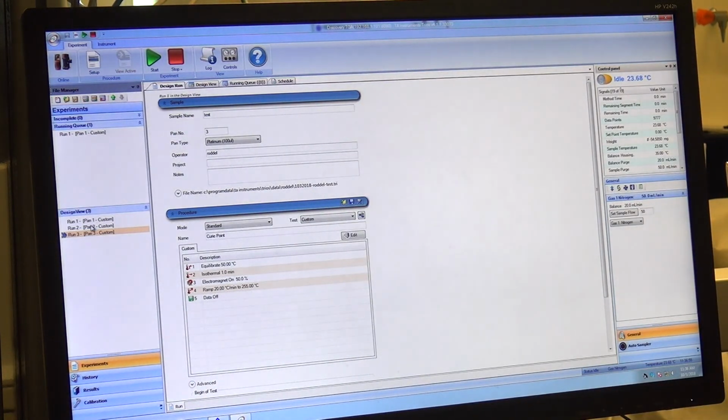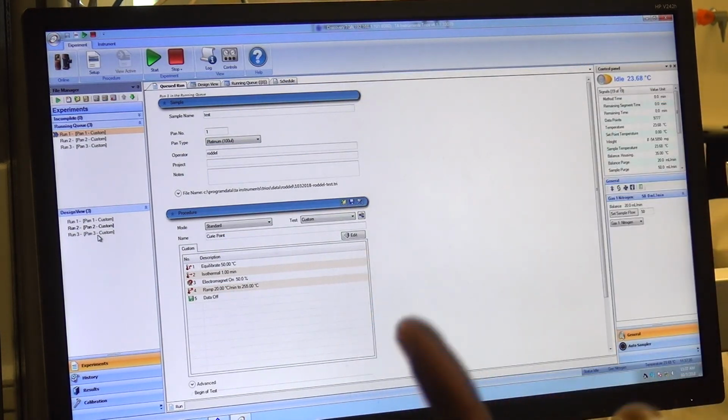And then now I can take all of these and copy them up here. Well, actually one at a time, it looks like. Hold on, delete that. So I can click here, click and drag, set the second one up there, click and drag, set the third one up there. Okay? So they all get up there, and I only really need to set up one experiment and copy everything else. Right?